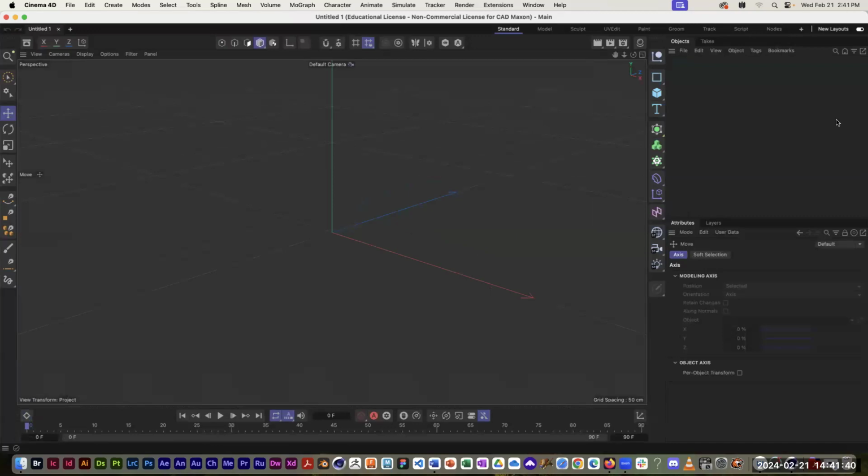And there is one other window that I need to open, which does not pop up by default. Let's see. There's a couple ways to view it. If you look in the upper right corner of my main window, you see there's little XYZ axes.